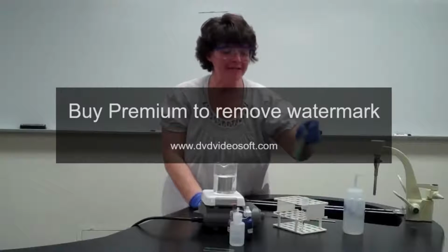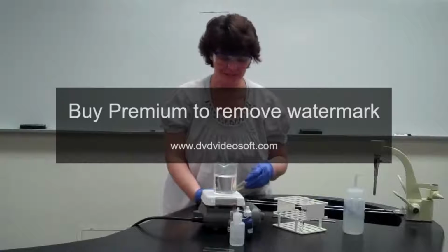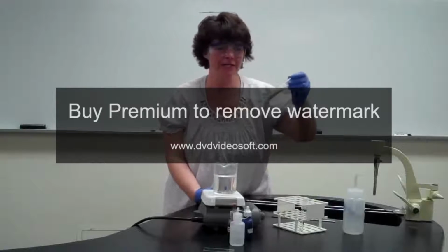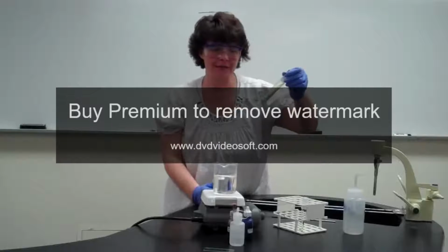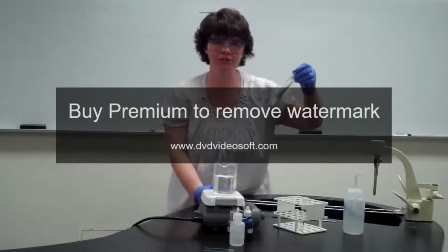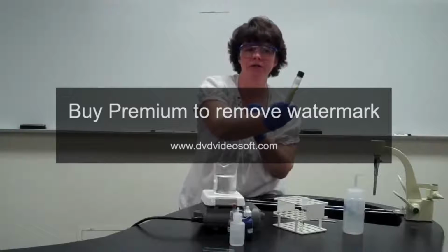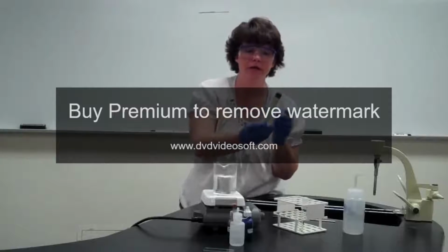Wow. If they don't grow up, we have a backup plan. This is the way we've done it in the past. You would actually take the bacteria off of this slant here. You'll notice some differences. The media is a blue color. It's a special media just for Mycobacterium. You'll also notice the bacteria is kind of yellow in color, and you can actually see the chunkiness of it.